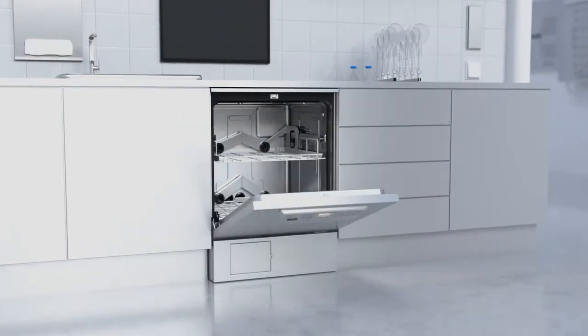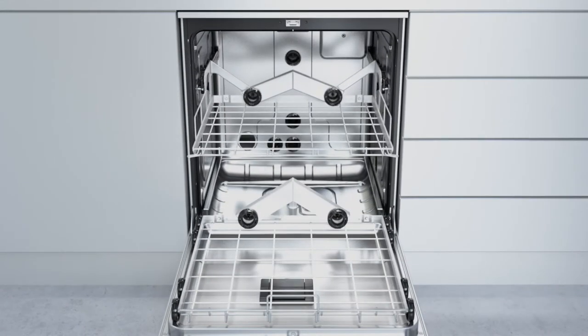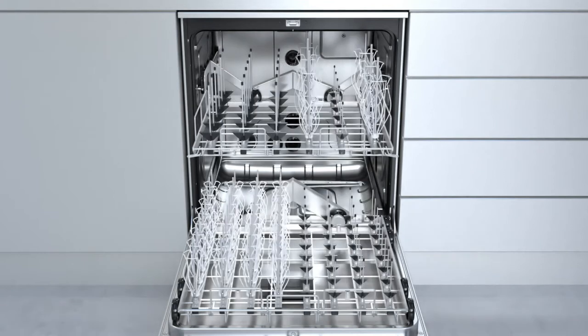There's no end to Miele's flexibility. The new washer disinfectors, more versatile than ever before. A modular concept offers many different configurations, using baskets which can be combined simply and intuitively.